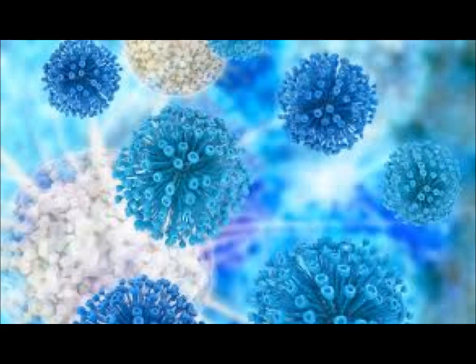The good sputum, so for our practical, on your last practical, is the clinical gram stain. You have to reject it if it's greater than 25 epis. And you say, nope, we've got to recollect, we don't even read the gram stain.